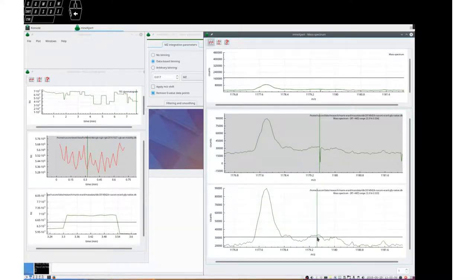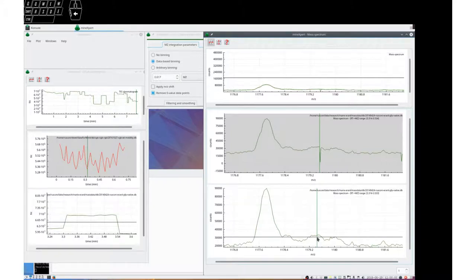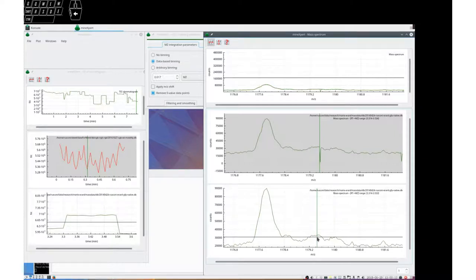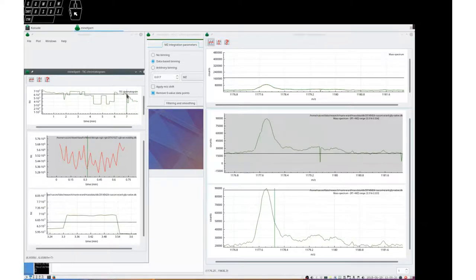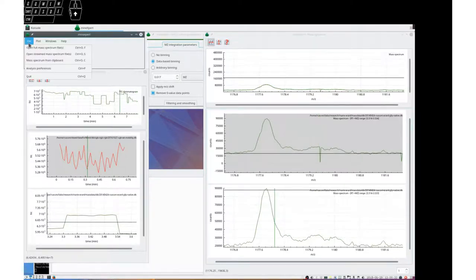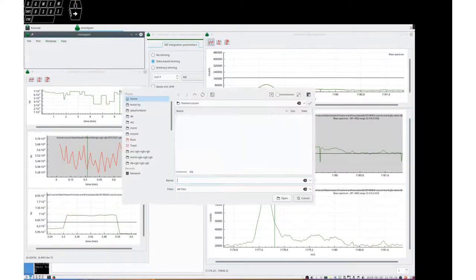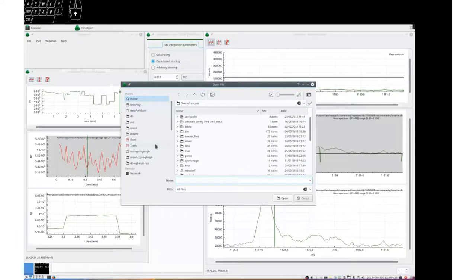I urge you to look at the user manual that explains that in more detail. It's important for you to grasp that mass spectrum combination is almost a science in itself. I will show you with a very eloquent example.